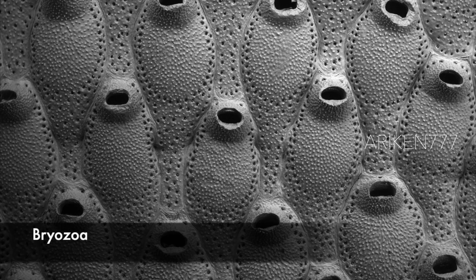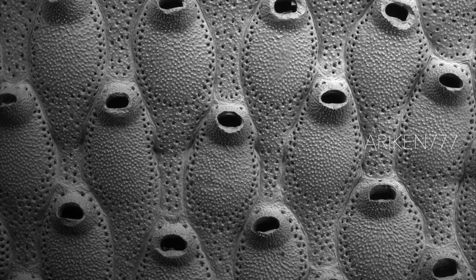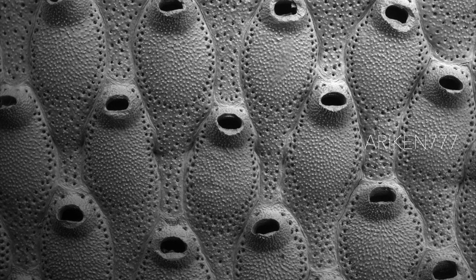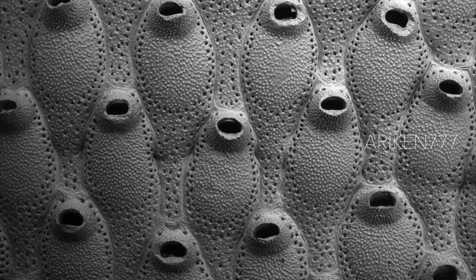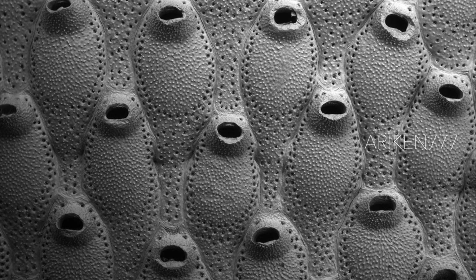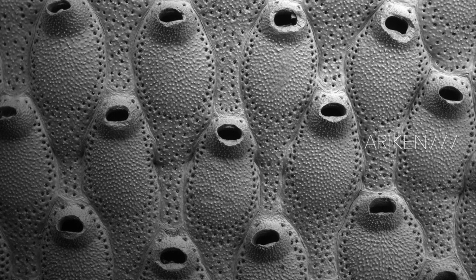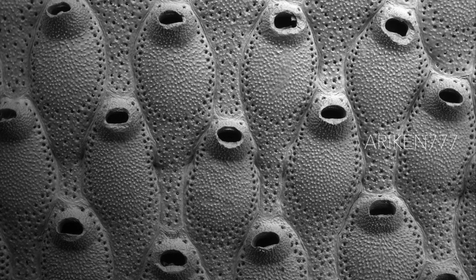These are the calcium carbonate skeleton of a bryozoan colony. Bryozoa are aquatic animals that consist of microscopic zooids that form colonies. A thin crust is formed around each zooid consisting of a protein and mucopolysaccharide material that can be calcified. Around 5,869 species have been discovered so far.